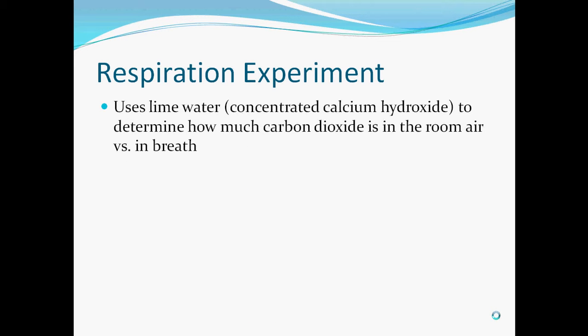In lab, the respiration experiment demonstrated the difference between carbon dioxide levels in the air and in our breath. When we bubbled exhaled air into a cup of lime water, the water turned cloudy, whereas when room air was bubbled using the pipette pump, no change was observed.